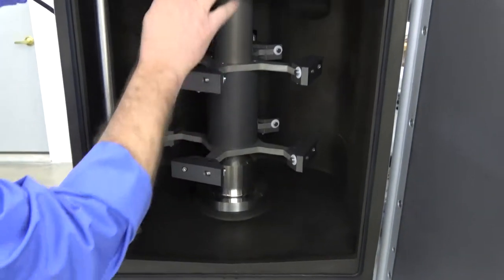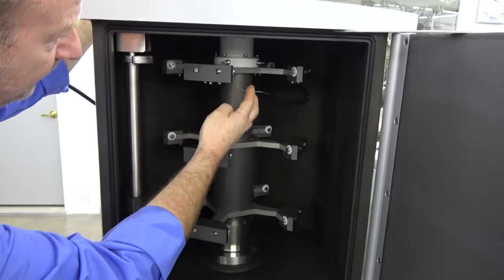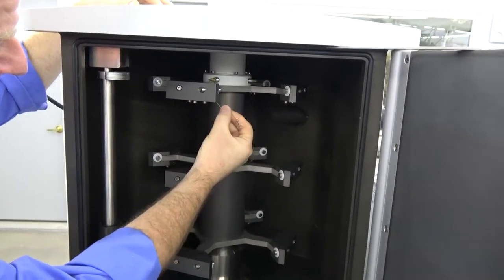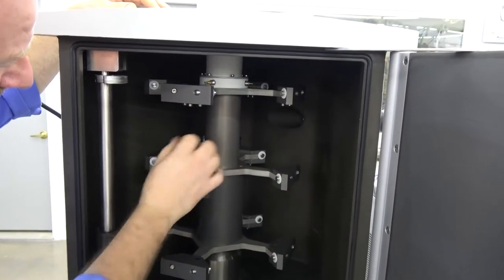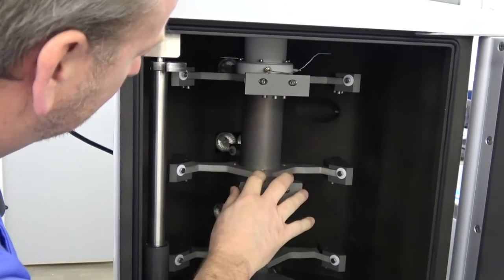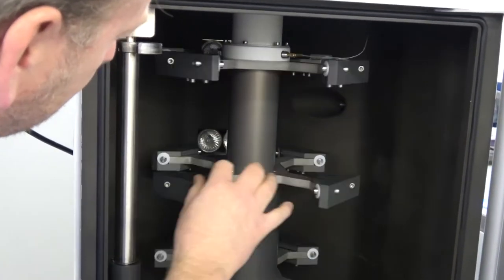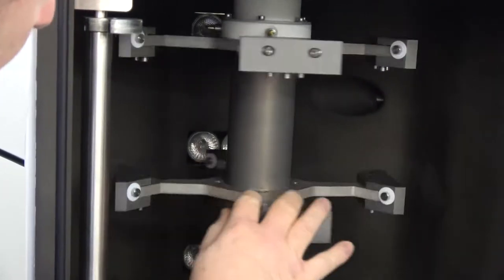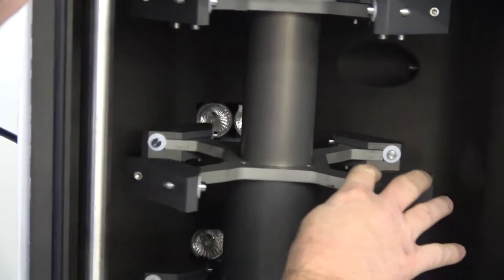And again, you can see it does have the temperature probe here that runs your sample temperature, monitors it, and then it controls the lights in the back so that you can keep a very consistent temperature on your samples. So everything is intact here for that.